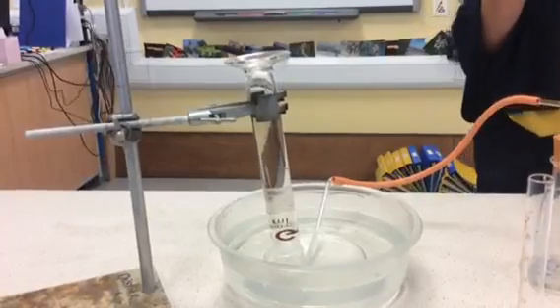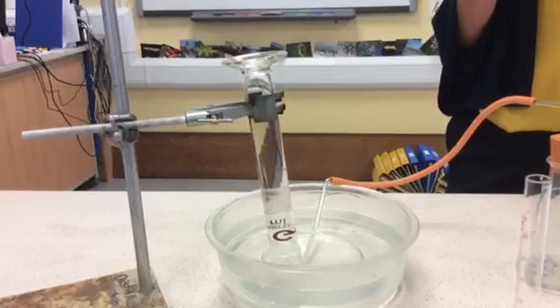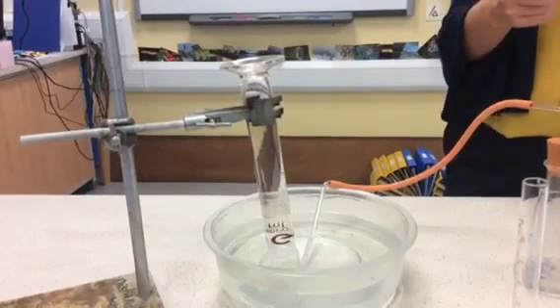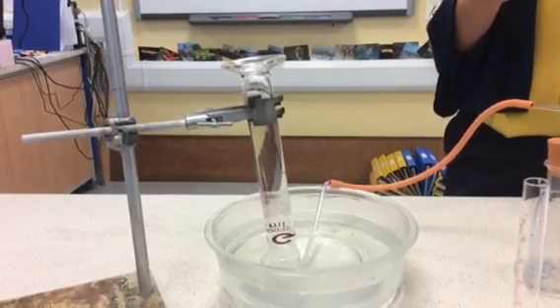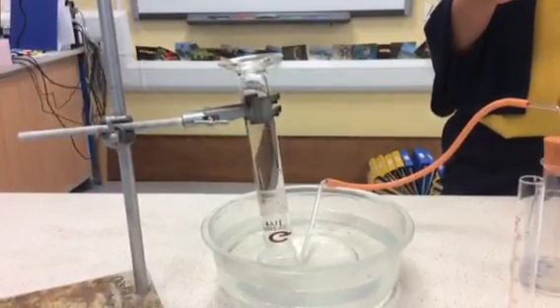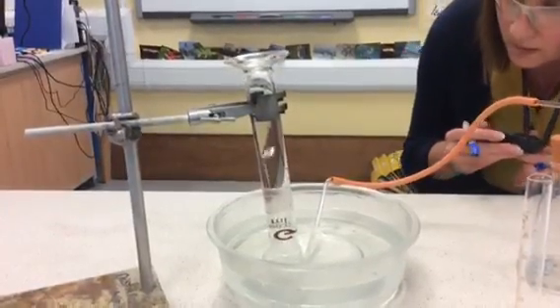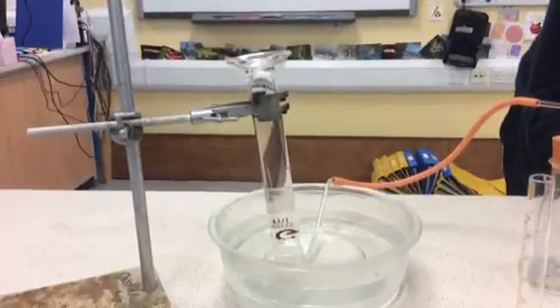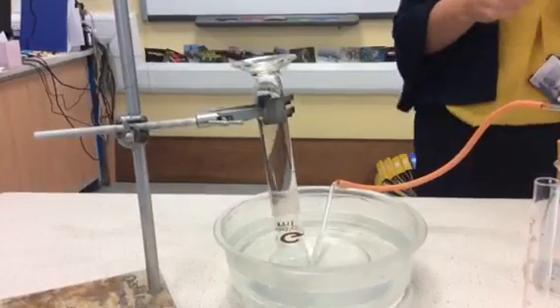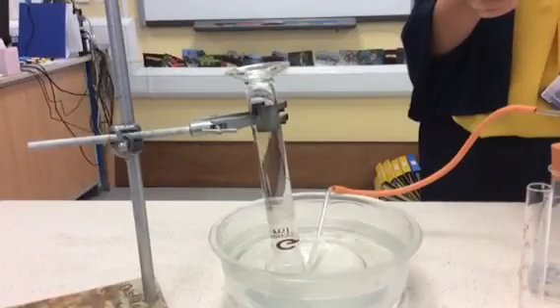Then we've got 1 minute left where we need to time. So we're looking for our next 30 seconds to see what volume of gas we've got this time. Okay, and our next 30 seconds, we are on 25 cubic centimetres of gas, and then our final 30 seconds. So we're looking to see the final volume of hydrogen gas produced.